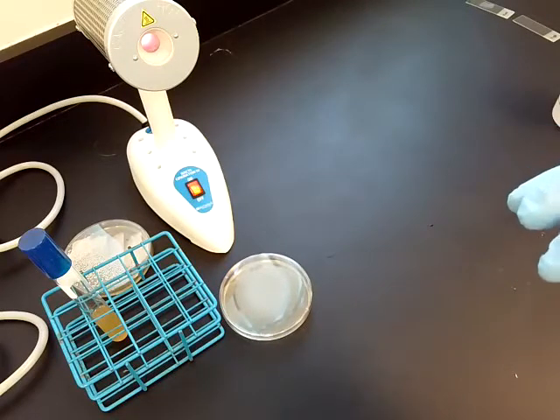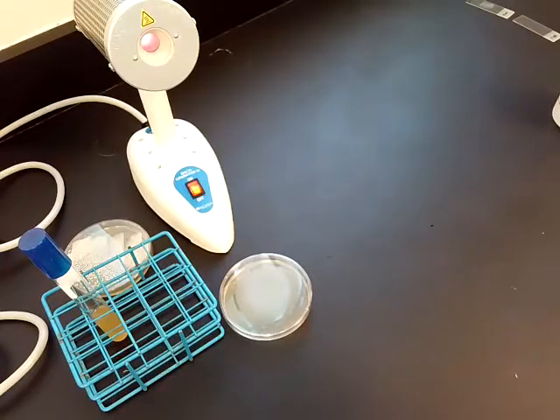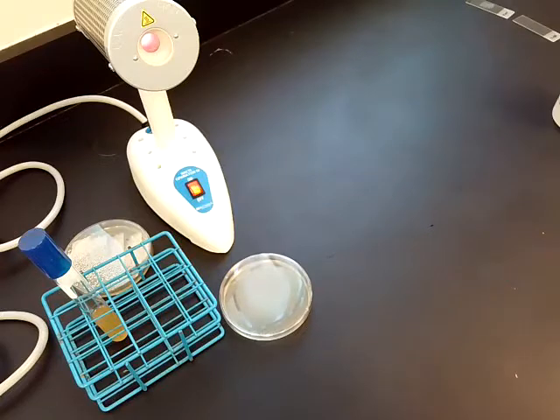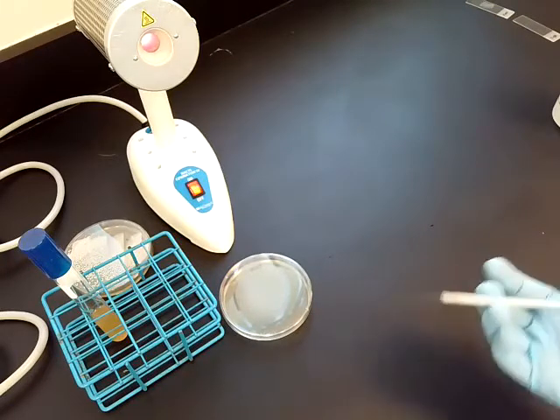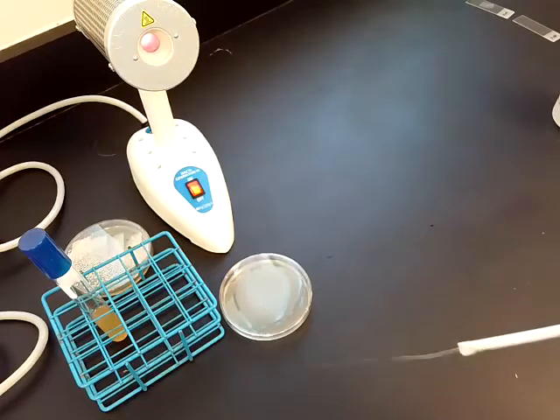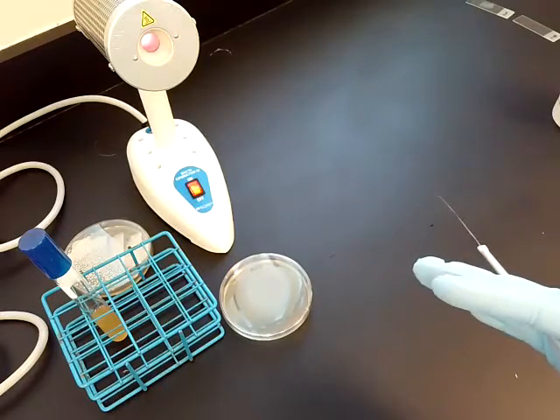Typically, a colony arises from the cell divisions of one bacterial cell. So you have one bacterial cell that has landed on the plate, divided, and grown into this visible cluster of bacteria. It typically takes 2 days or so before you can actually see the colony. So when you initially put it down on the plate, it's just one cell, it's microscopic, but then it'll grow to this visible cluster of bacteria.